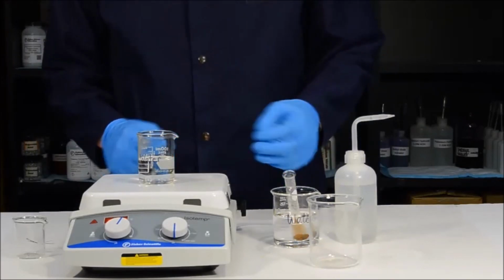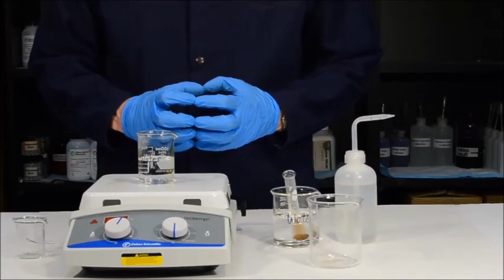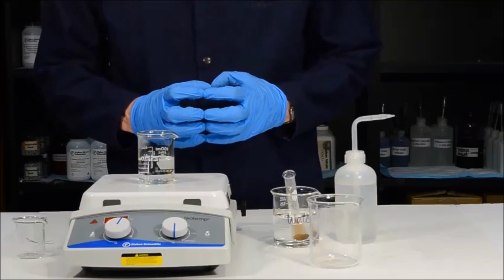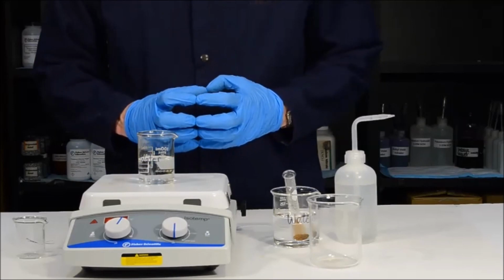Here I've only done one trial with a single test tube, but when you're doing the experiment, it's very important that you do this in triplicate and that you do everything to all 3 test tubes at the same time. If you try to use one test tube and then the next and then the final test tube, the experiment will take far more than 3 hours. It's very important to do all 3 test tubes at one time.